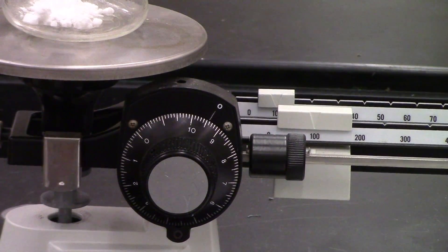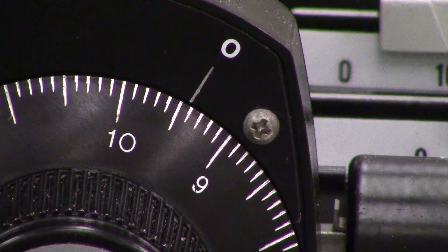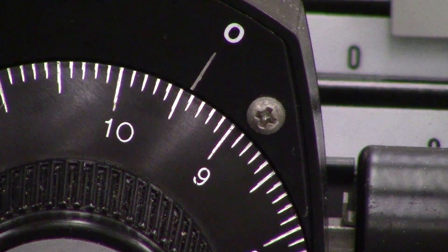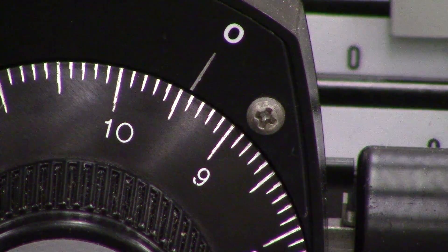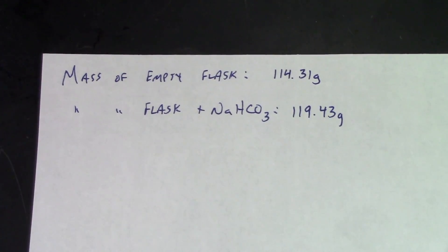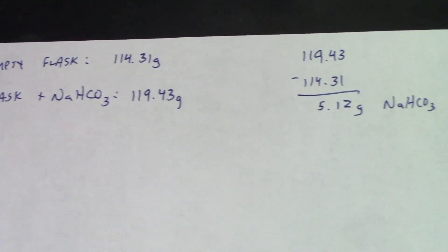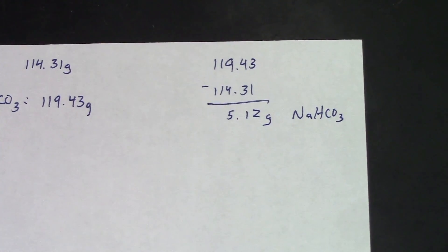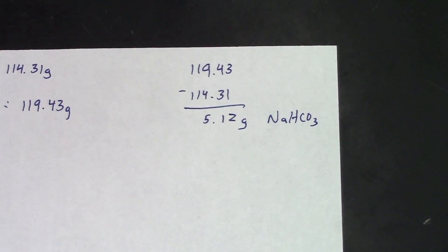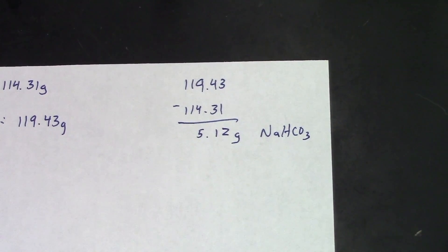I've gone slightly over 5 grams with my baking soda, so we need to check and see exactly what mass we currently have. That looks like about 119.43 grams, so that's how I'm going to record it. Here I've recorded the mass of the flask with the baking soda in it at 119.43 grams. Subtracting the mass of the empty flask gives us 5.12 grams of baking soda to start our reaction.